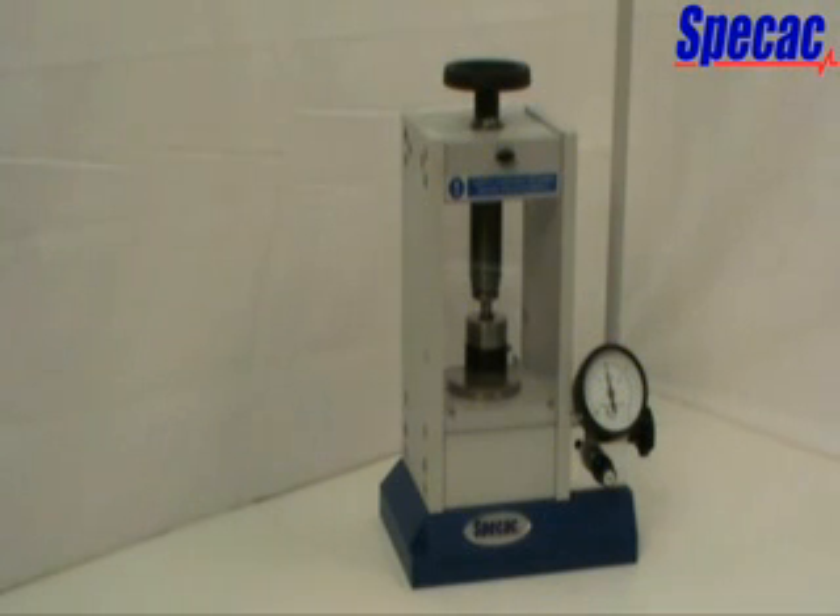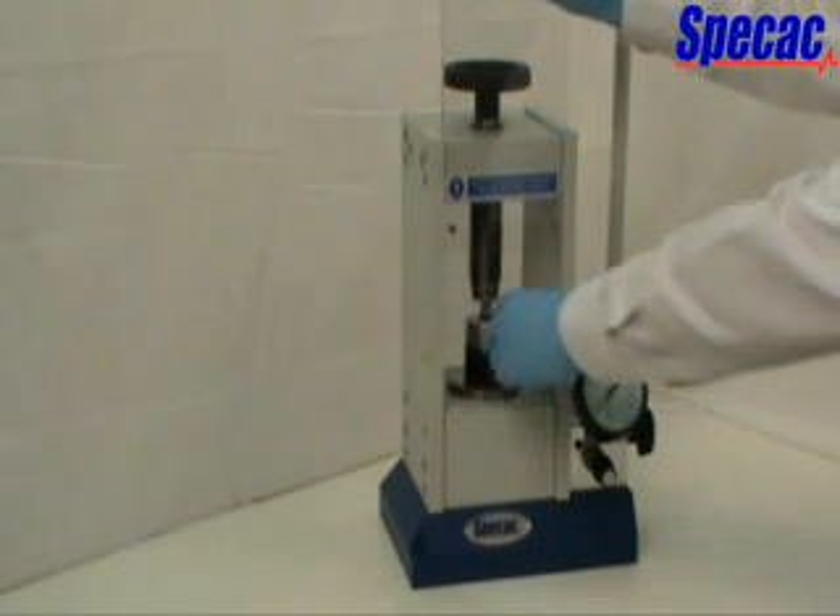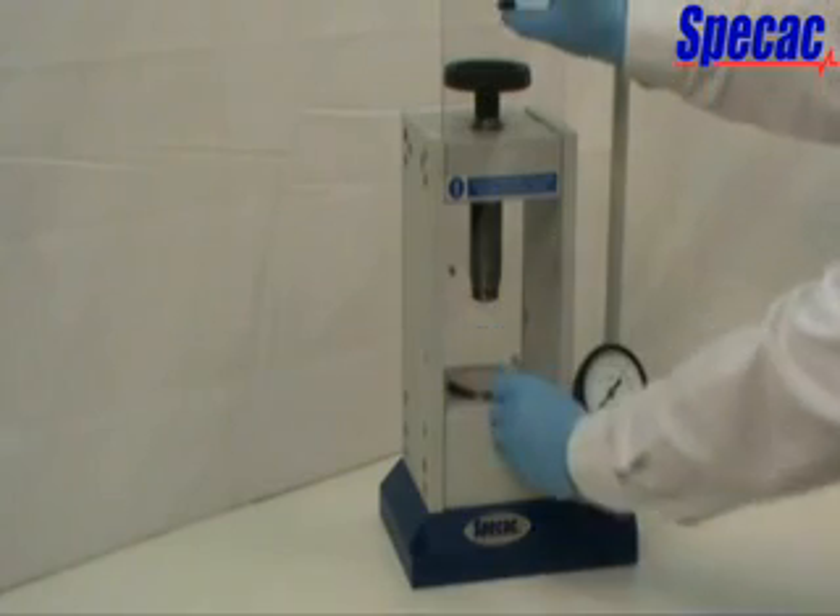To release the load on the work, turn the pressure release handle anticlockwise by about one half of a complete rotation. There is no need to turn this handle completely open. When the tonnage load has been released from the work, it is safe to open the front safety guard and gain access to the work that has been pressed.